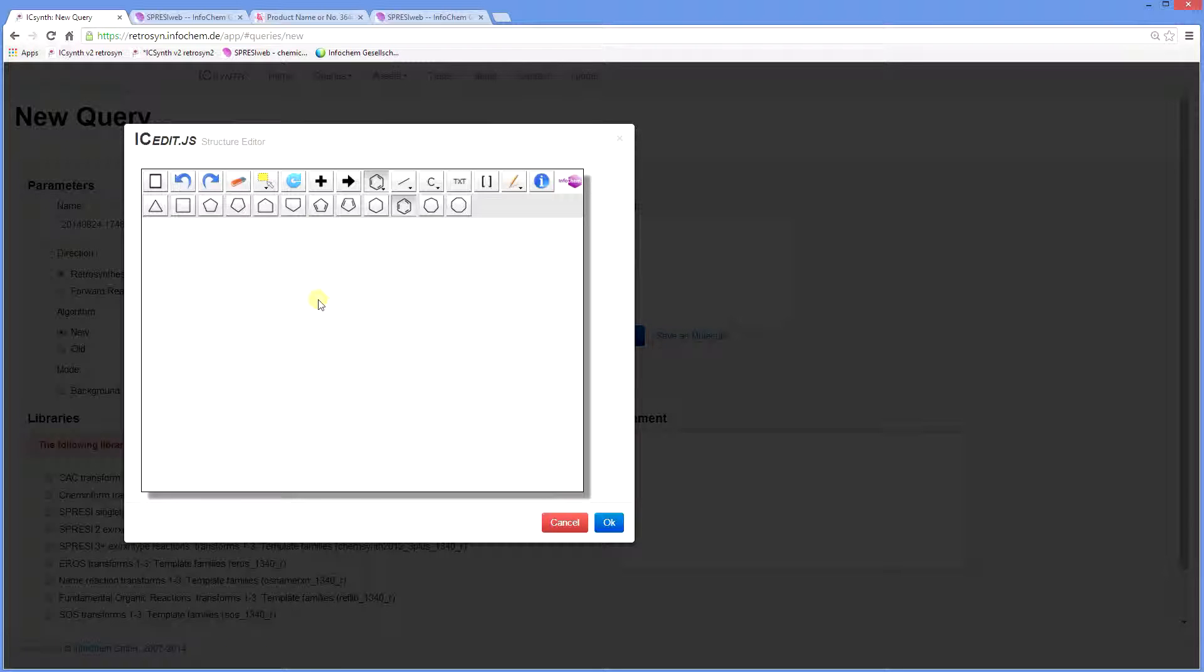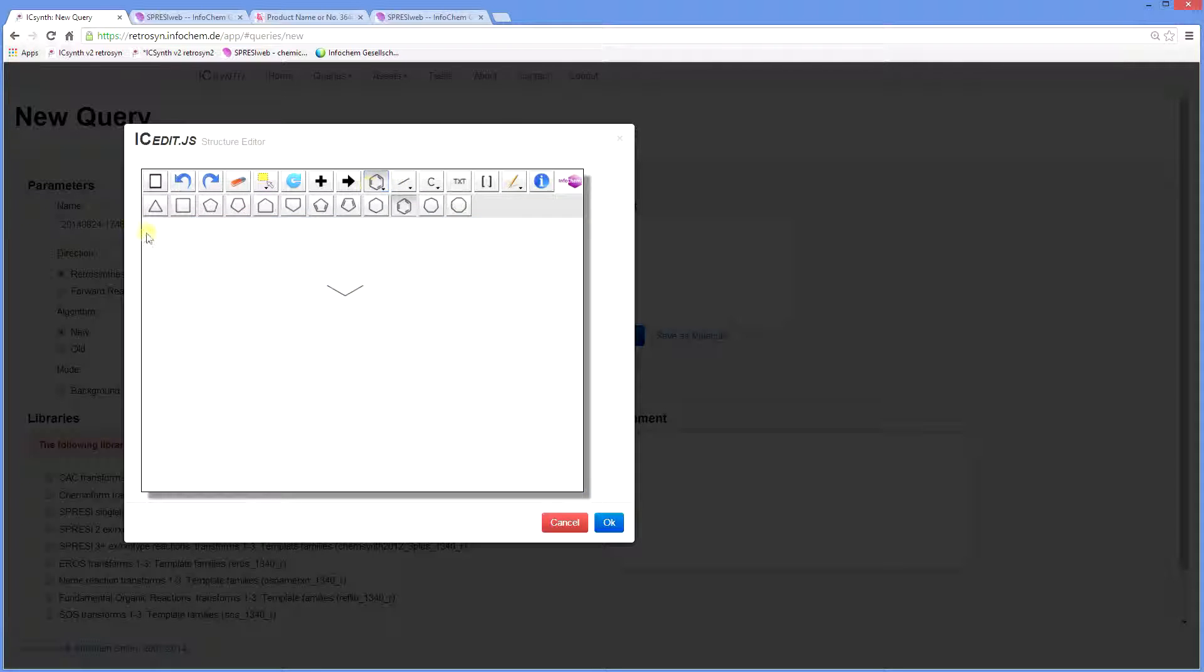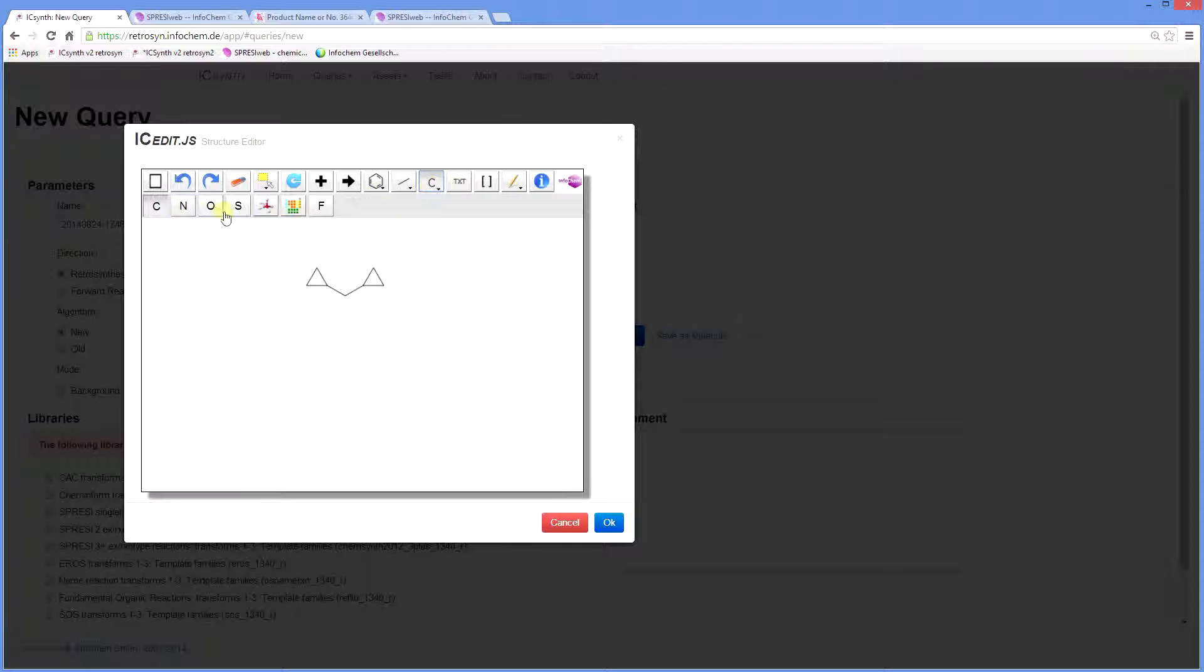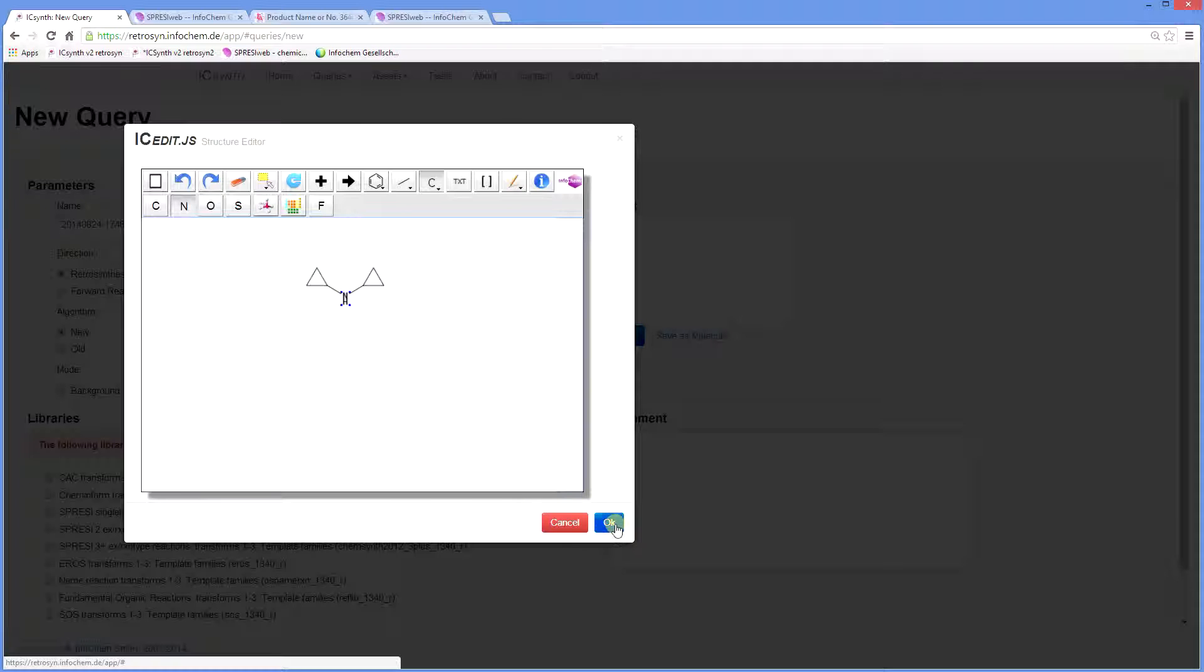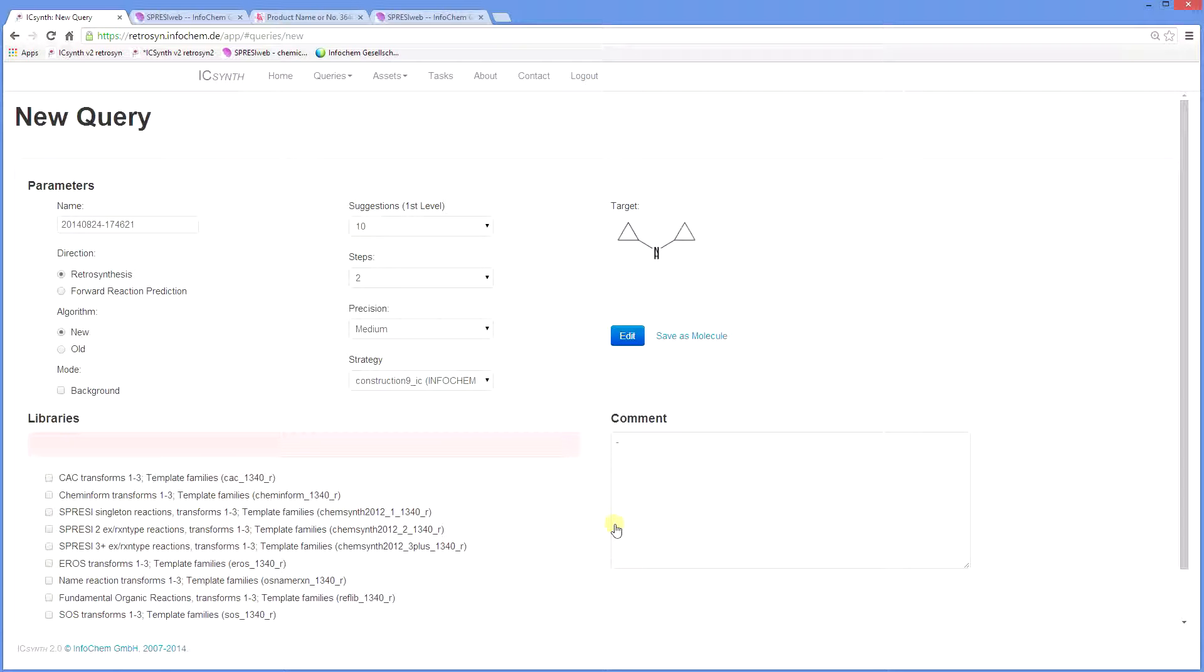ICSynth provides all the features required to draw structures. We will now input our target molecule. First of all I will draw a short chain. Then add two cyclopropane rings. And finally a nitrogen atom.